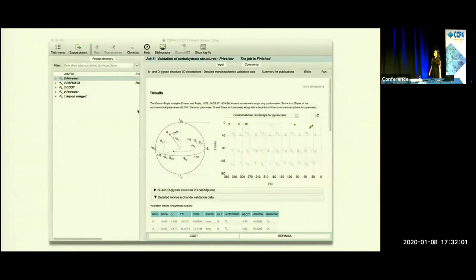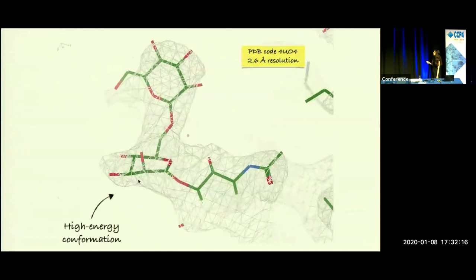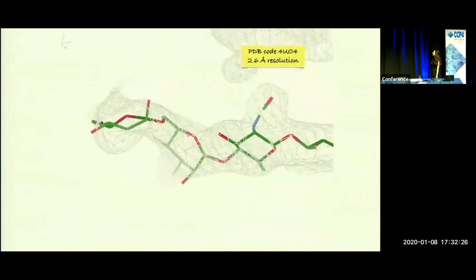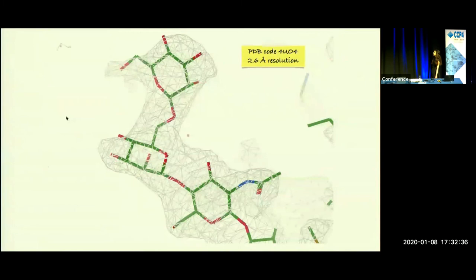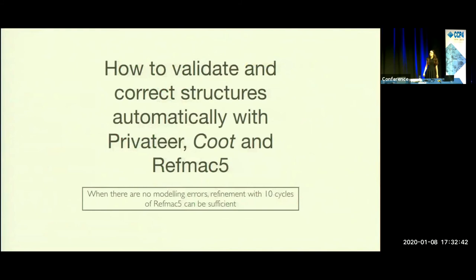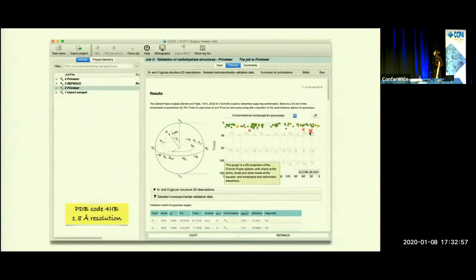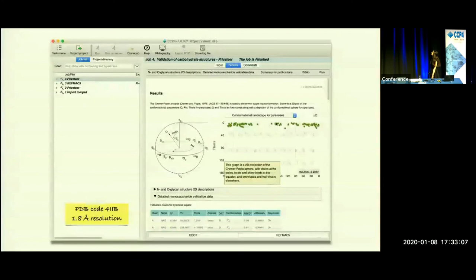If we run Privateer again we can see that all of the sugars are validated as correct. Now I'm going to show you a lower resolution structure where even a correctly built model can still be distorted after refinement. Here you can see a high energy conformation has been created. We refine it with Privateer's restraints and now it has been corrected. Finally, when there are no serious modeling errors, we can just refine a structure with 10 cycles of REFMAC using Privateer's torsion restraints. Before refinement we have a few incorrect sugars, but after we run REFMAC all of the sugars have now been corrected.